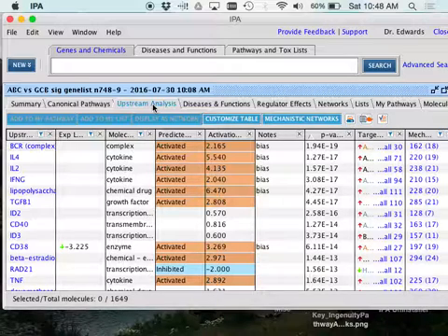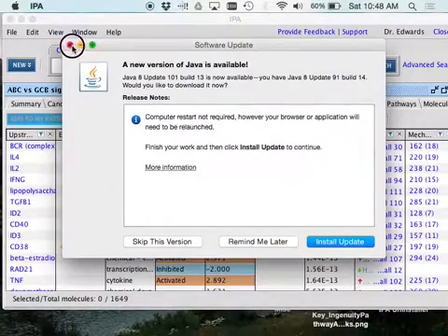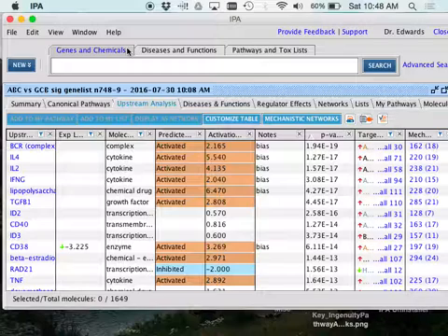But this software knows what they interact with. Based on their known targets, and those targets being overrepresented in our gene list, it'll find me those godfathers. I'm going to show you how that works. It's really, really cool.